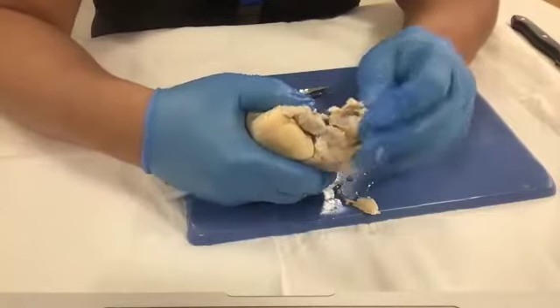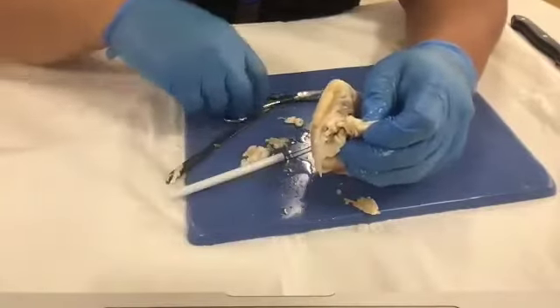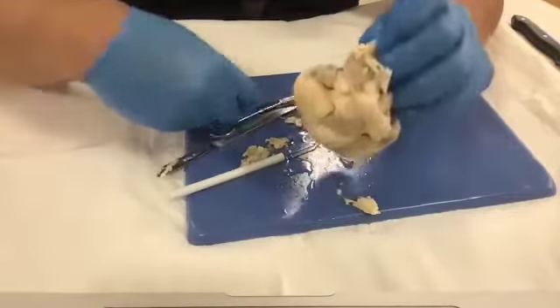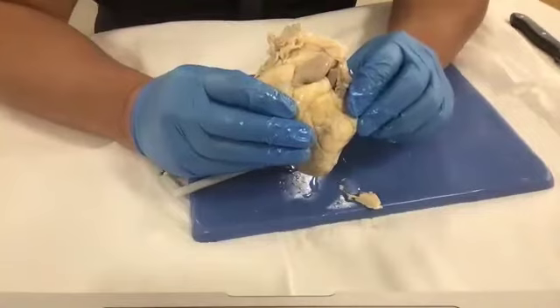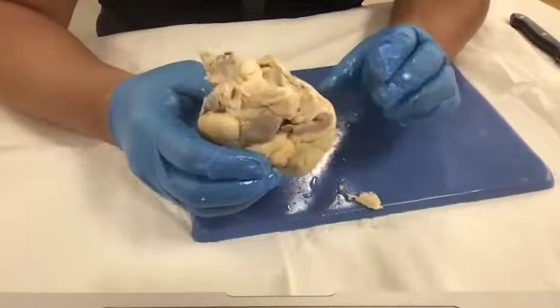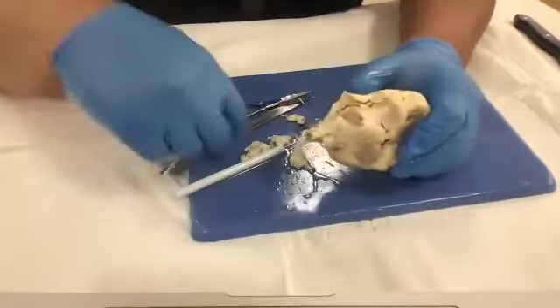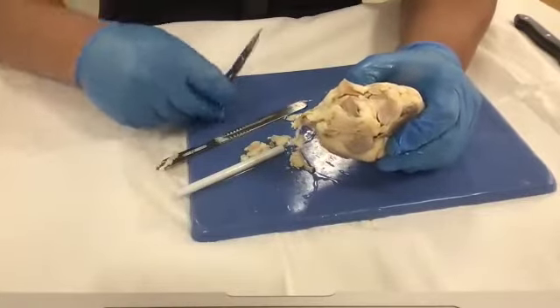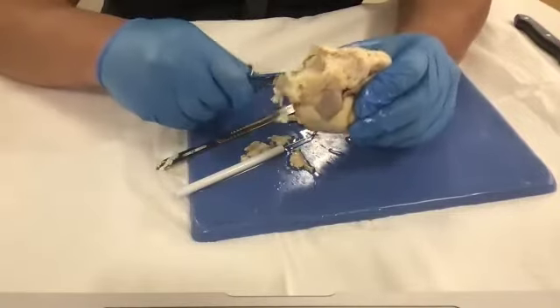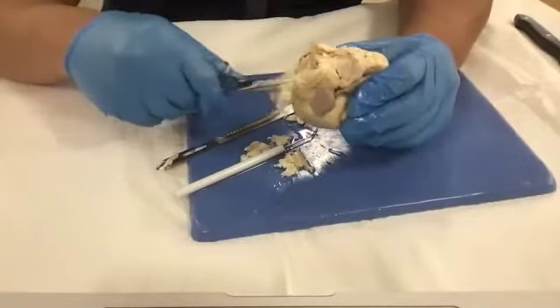So that's how you identify the great structures up here. And if you were here in lab, we would have you cut all this and then identify all the tubing up here. So for those of you playing along at home, what do you call that? Look at your diagram, and look at the box diagram video, and make sure you can identify all the tubes. And if you look at this in real life, all the tubing is kind of all the same color. So you've got to use your other senses. You've got to feel around.